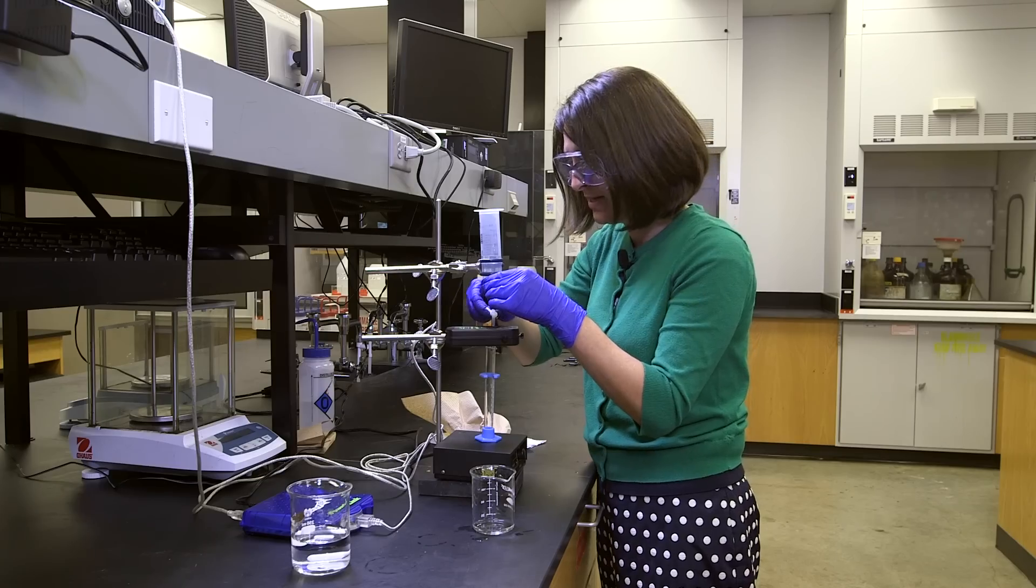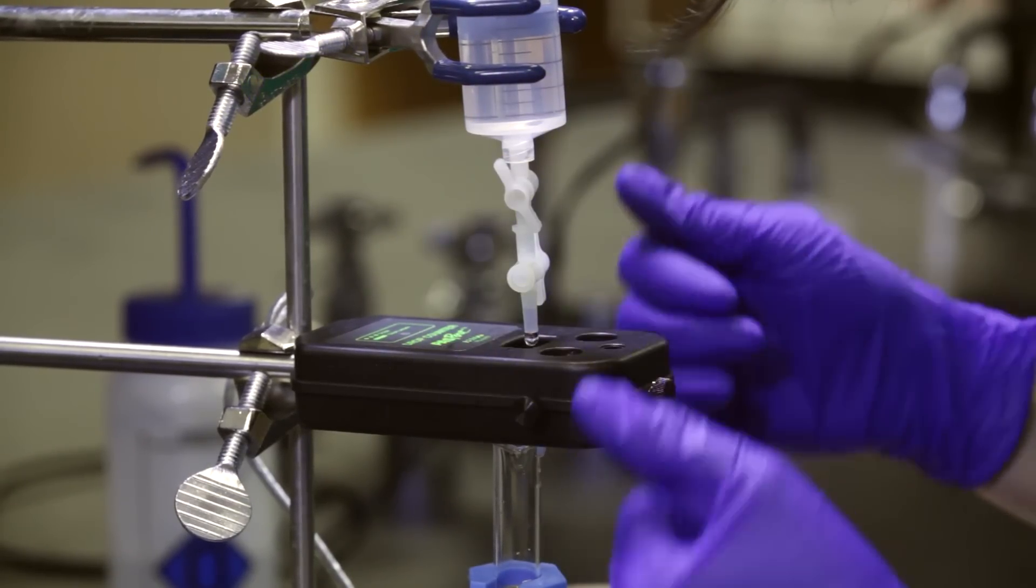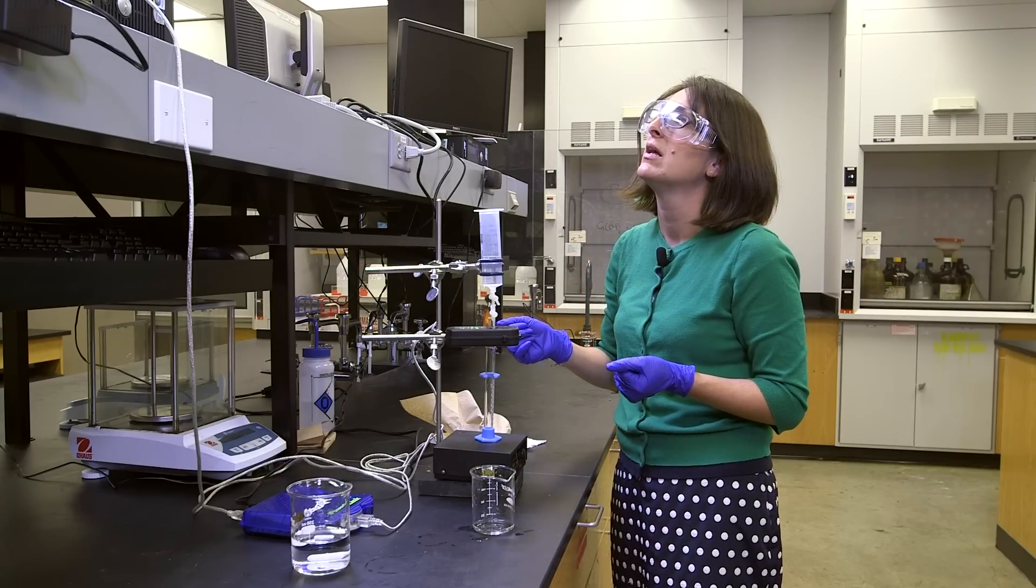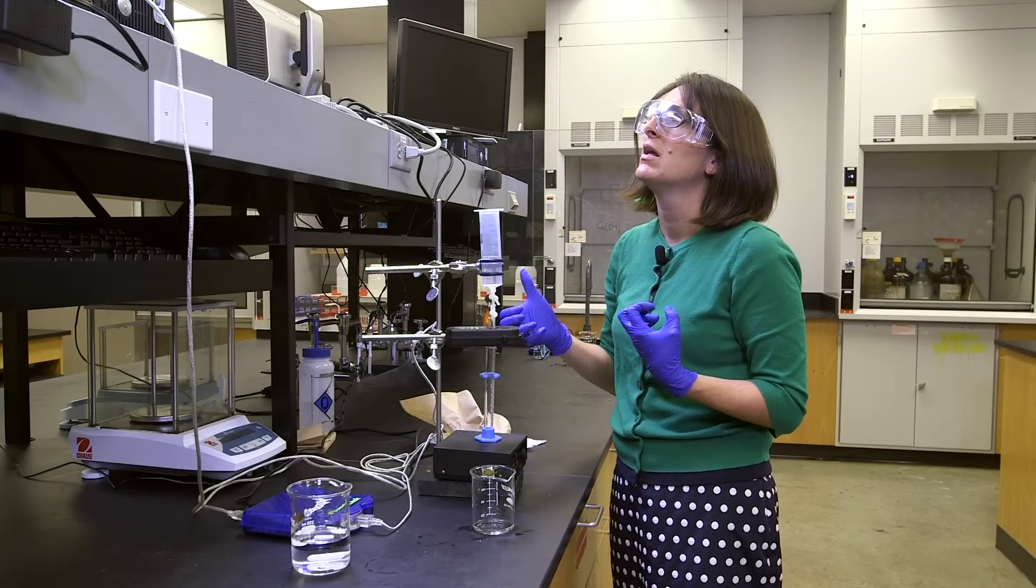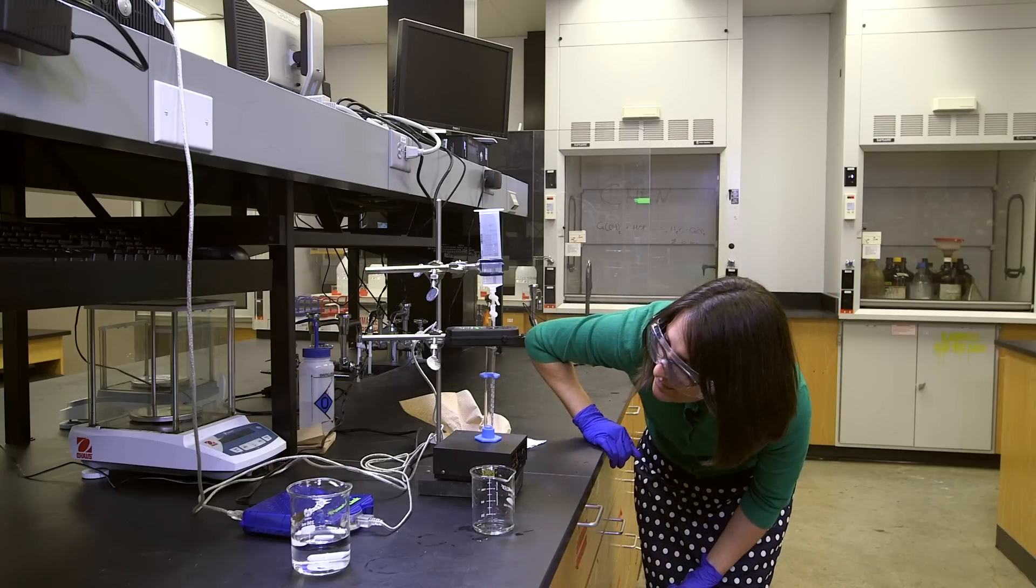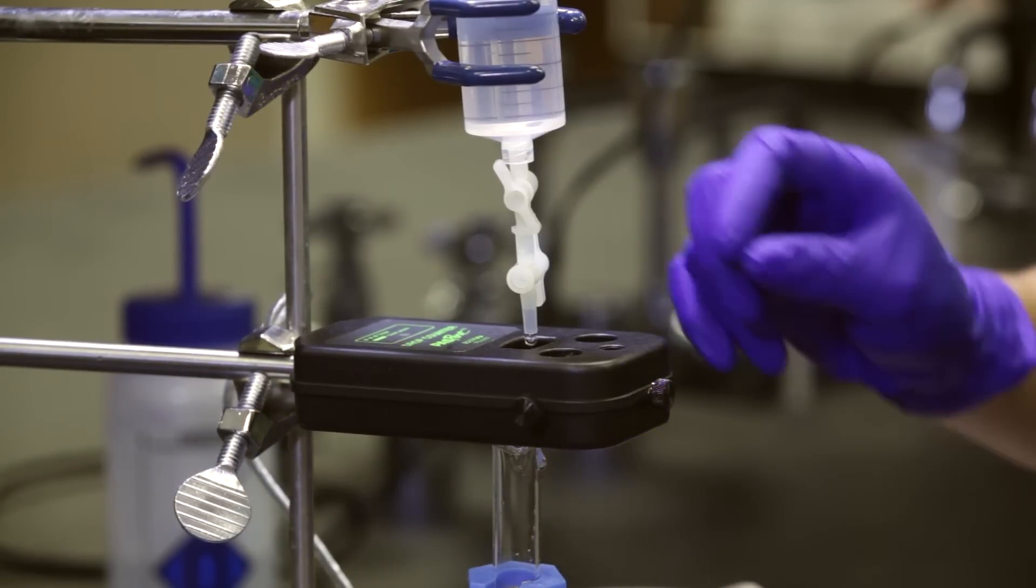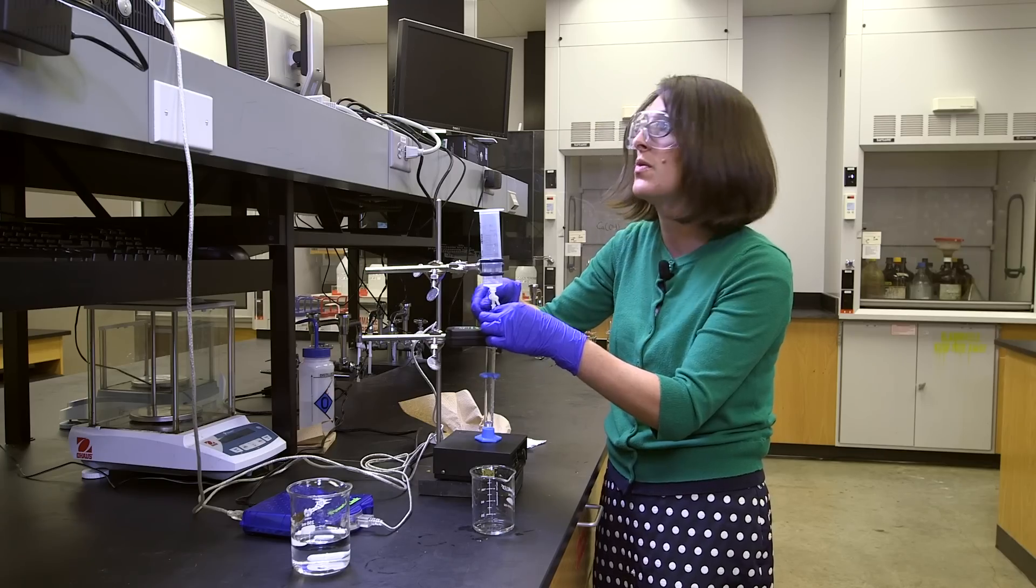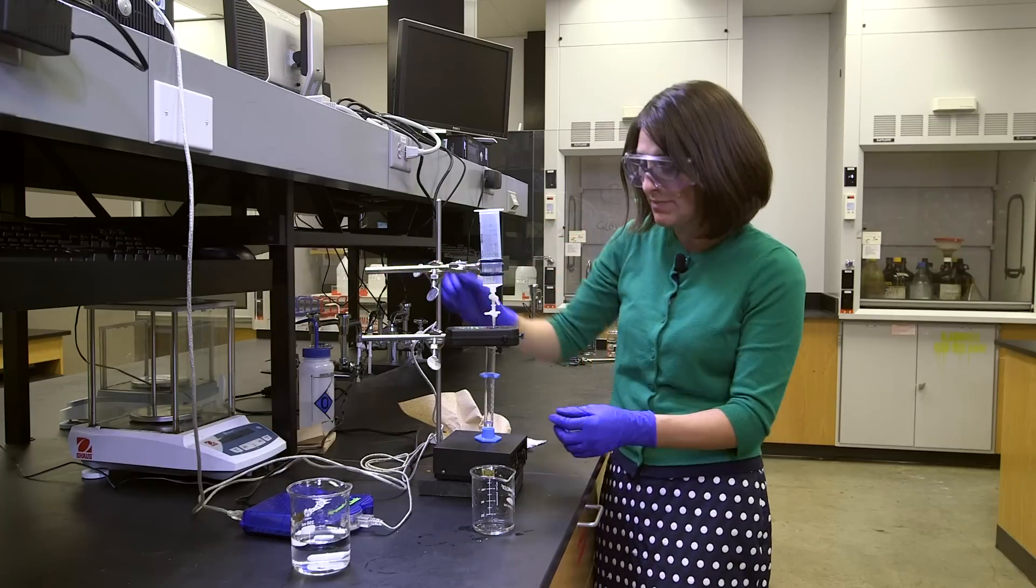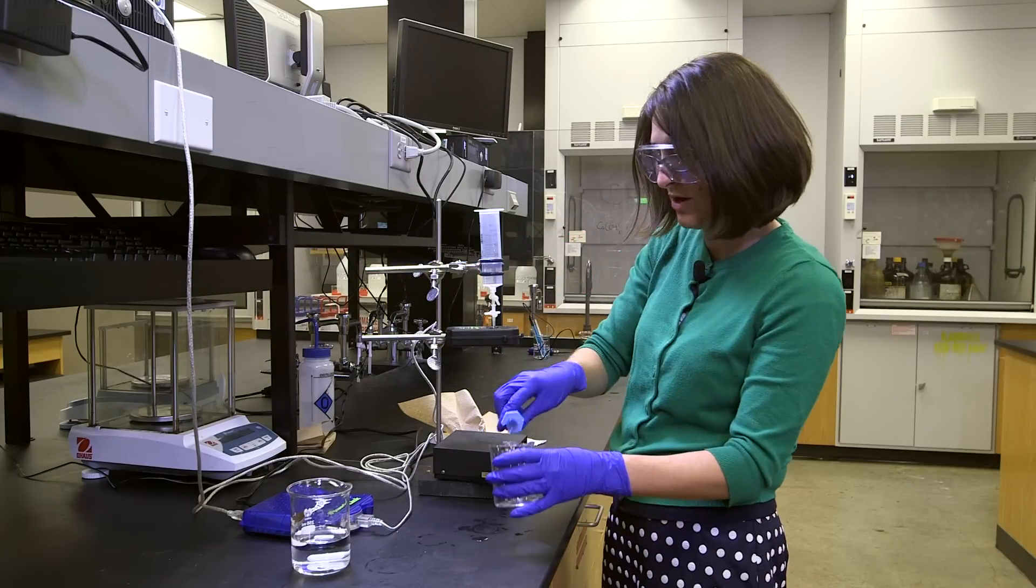I'm going to make sure that it's going into my graduated cylinder, which is how I'm going to measure the amount of liquid. Oh, but some of my drips are going outside. So that means I have to stop because if some of my drips are going outside, that means that I'm not collecting all of the volume. So I'm going to start all over.